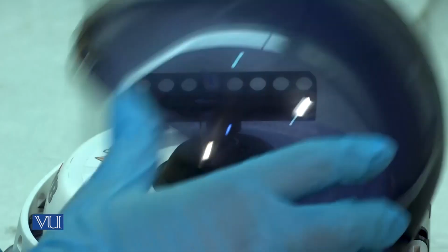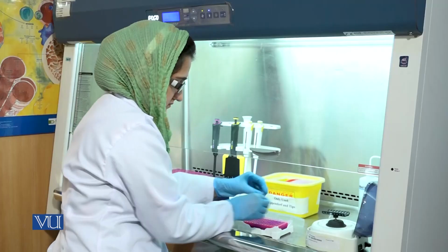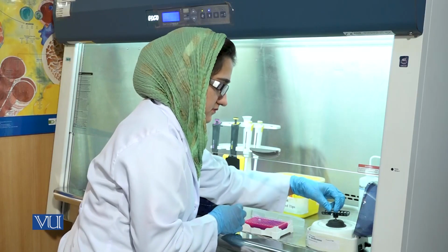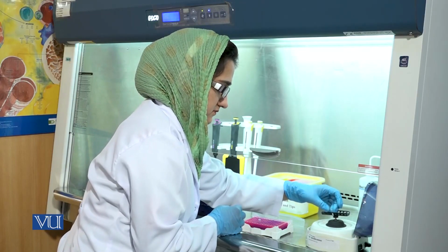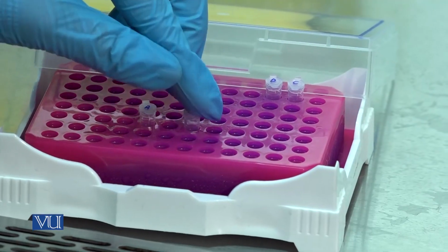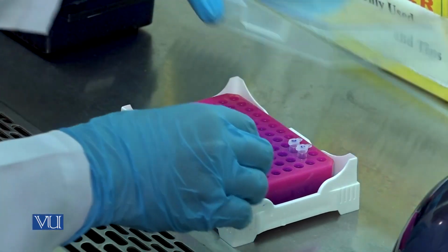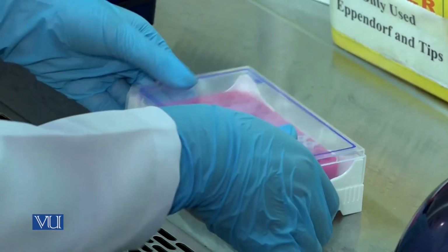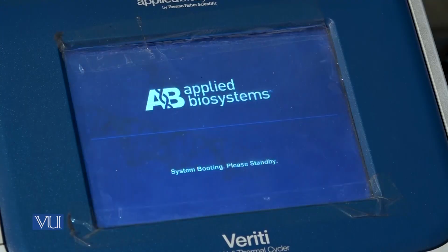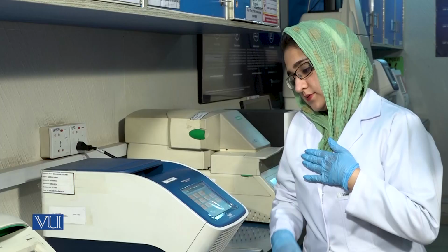After centrifugation, put the tubes on the cooling rack. Next step is incubation at 65 degrees centigrade for 5 minutes.